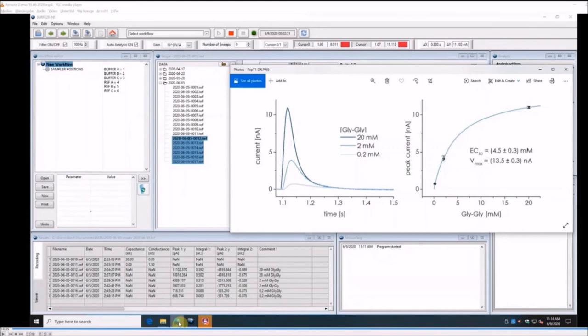However, it is possible to apply membrane voltages with ionophores, for example, if you want to have a basic potential as a driving force. So there are some workarounds. However, it's not a voltage clamp system. So you cannot apply voltage jumps as you would do in patch clamp.